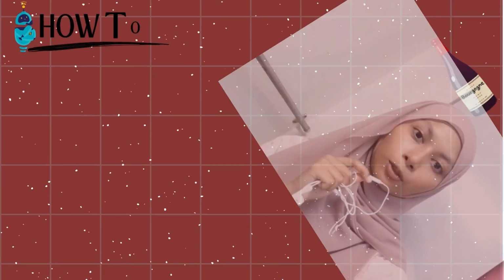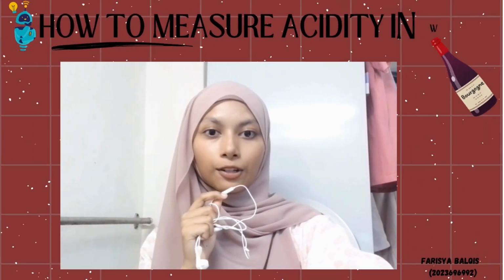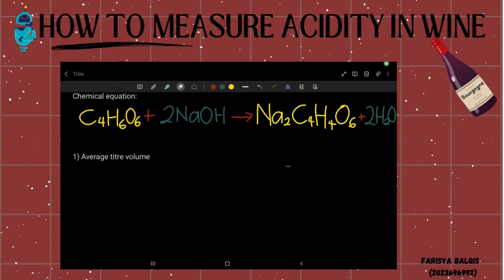In this part, I'm going to show you the calculation of how to measure acidity in wine. Now, let's talk about how we can measure the acidity in wine using titration, specifically to determine the amount of tartaric acid present. We begin with the balanced chemical equation at the top. 1 mole of tartaric acid reacts with 2 moles of sodium hydroxide and produces 1 mole of sodium tartrate with 2 moles of water.